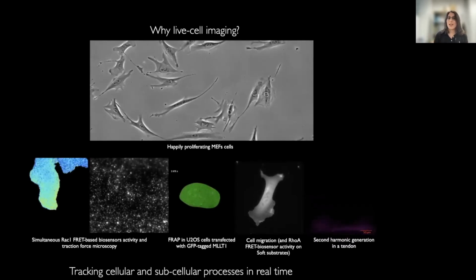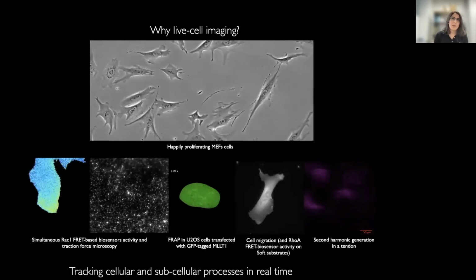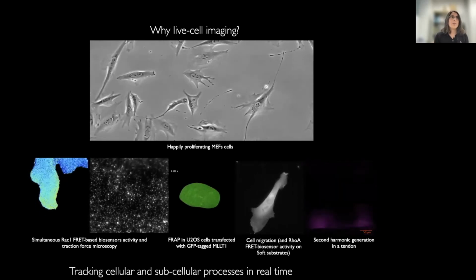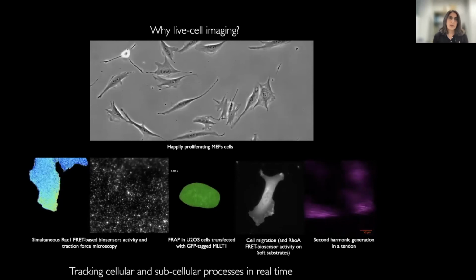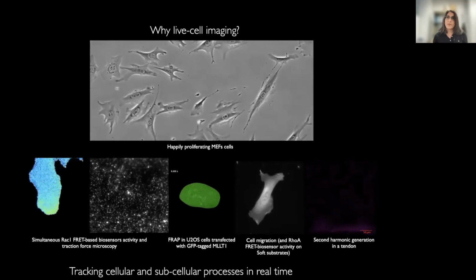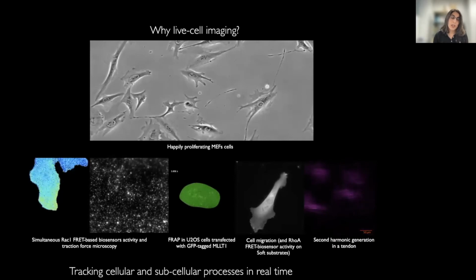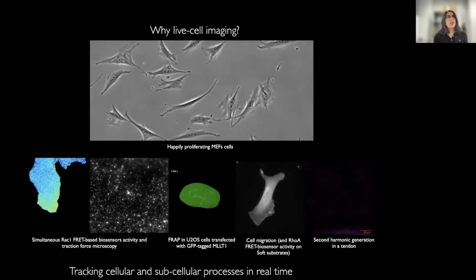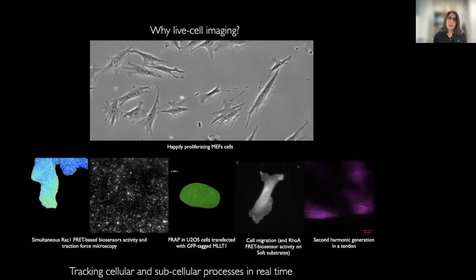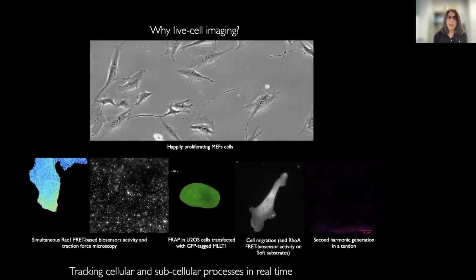So, why live cell imaging? Well, live cell imaging, or time-lapse imaging, provides an accurate record to study dynamics, cellular processes, behavior and function in real time over time. It gives a more realistic view of biological function. However, it is much more challenging to image live cells, keeping them alive on the microscope stage and healthy over an extended amount of time.